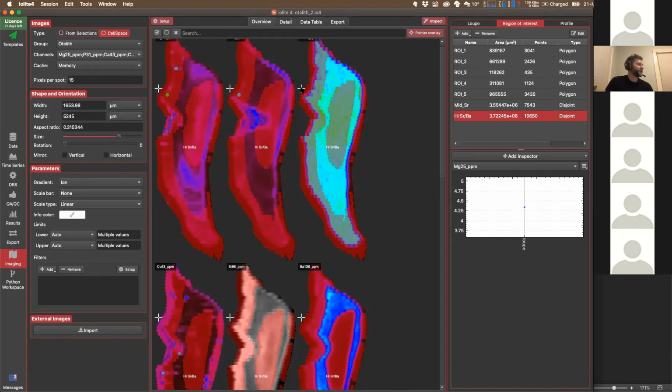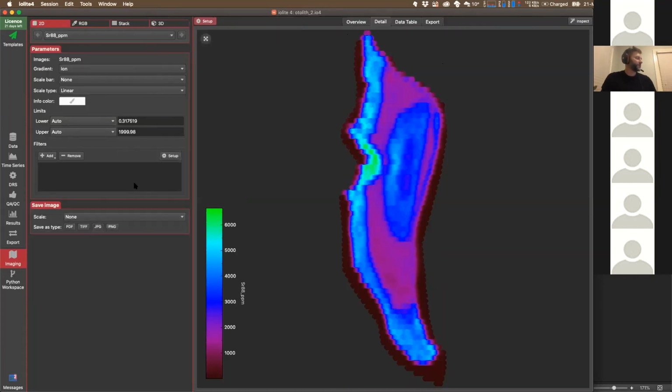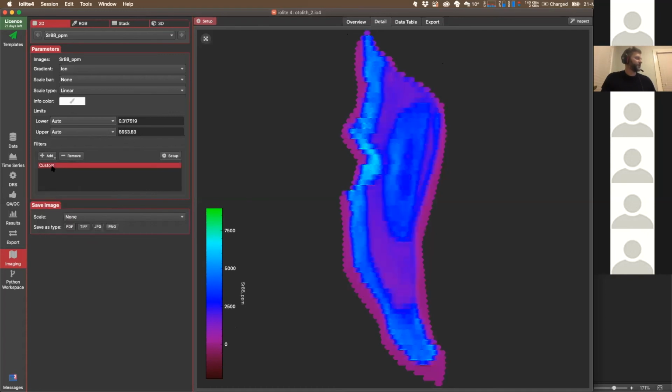All right, yeah, we have time now, so let's talk about the filtering. And the custom one, if I just show that very quickly, if you click on that, it allows you to actually type in your own kernel that is convolved with your image. We'll be adding a few different ones, like some sharpening ones and maybe some edge finders, those sorts of things. So this is by default a sharpen kernel, Joe's telling me.